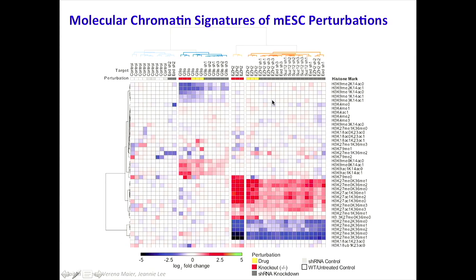But then you can see the very strong signatures in the assay, whether we have perturbed this G9A system by knockdown, drug, or knockout, or have perturbed this Polycomb Repressive Complex 2 system, again, by knockout, drug, or knockdown, they all generate very similar signatures. So we can collapse all the replicates for each of the hairpins that we used in the study, and formulate them as a connectivity map. And what you get is this.